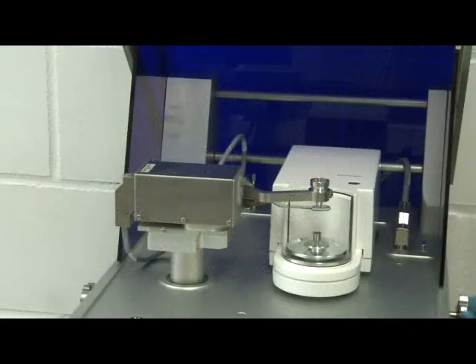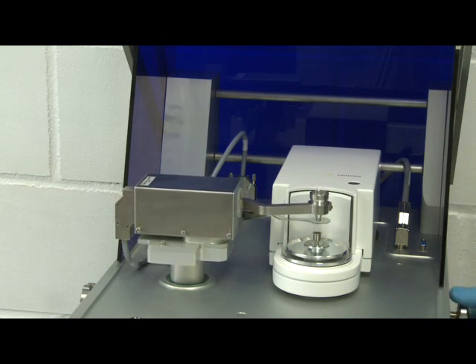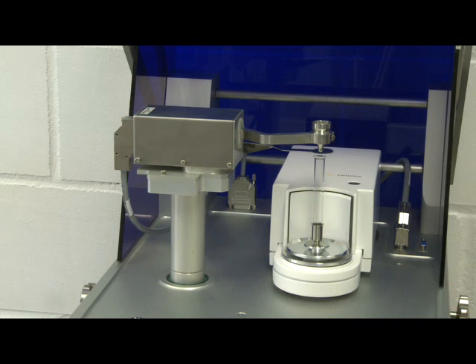Depending on the height of your receptacle, the tapper pillar may need to be extended. For example, a short tapper pillar is suitable for capsules, whereas the taller pillar is required for tall receptacles.